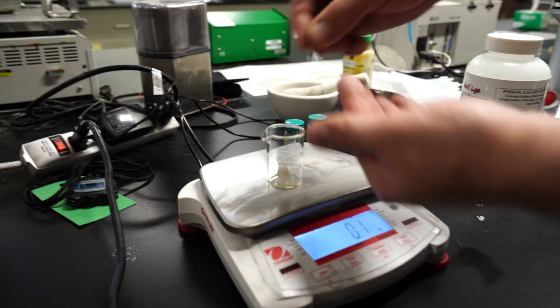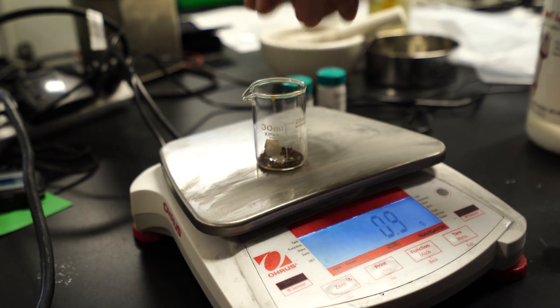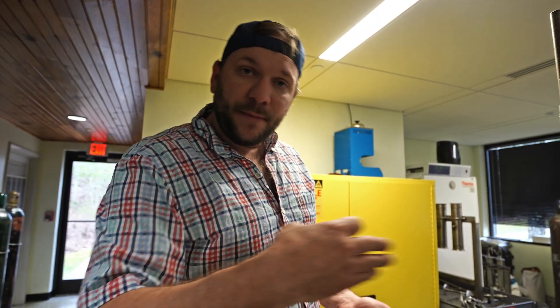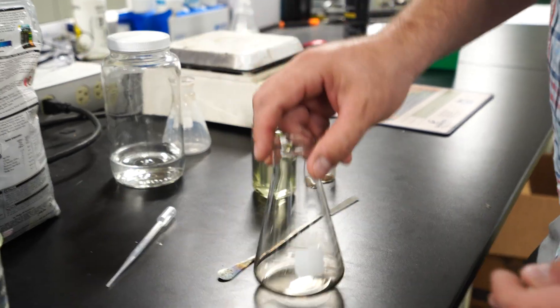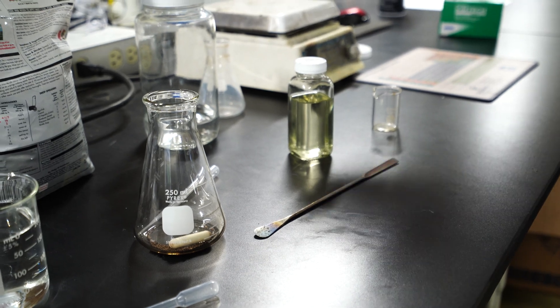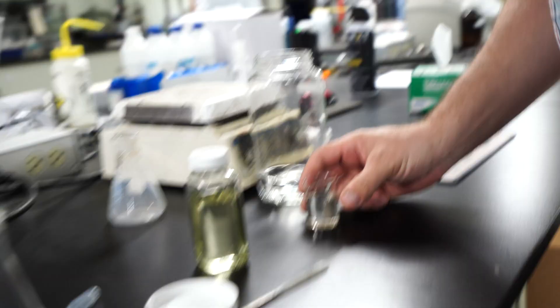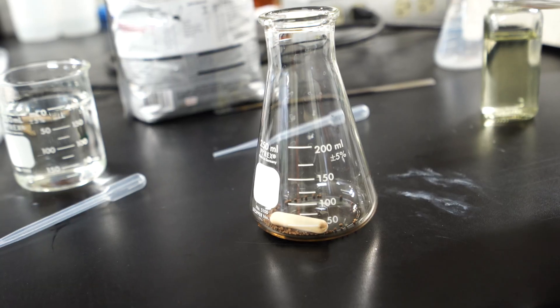We got one gram. Let's go prepare our solution so that way we can backward titrate it and calculate the calcium carbonate equivalent of this product. We're going to put this in a bigger Erlenmeyer flask. We're going to put this one gram of lime in there, drop a stir bar, and then we'll add 25 milliliters of hydrochloric acid to facilitate the reaction. This is one mole hydrochloric acid. We'll add it in and you're going to see a pretty significant reaction of bubbling.